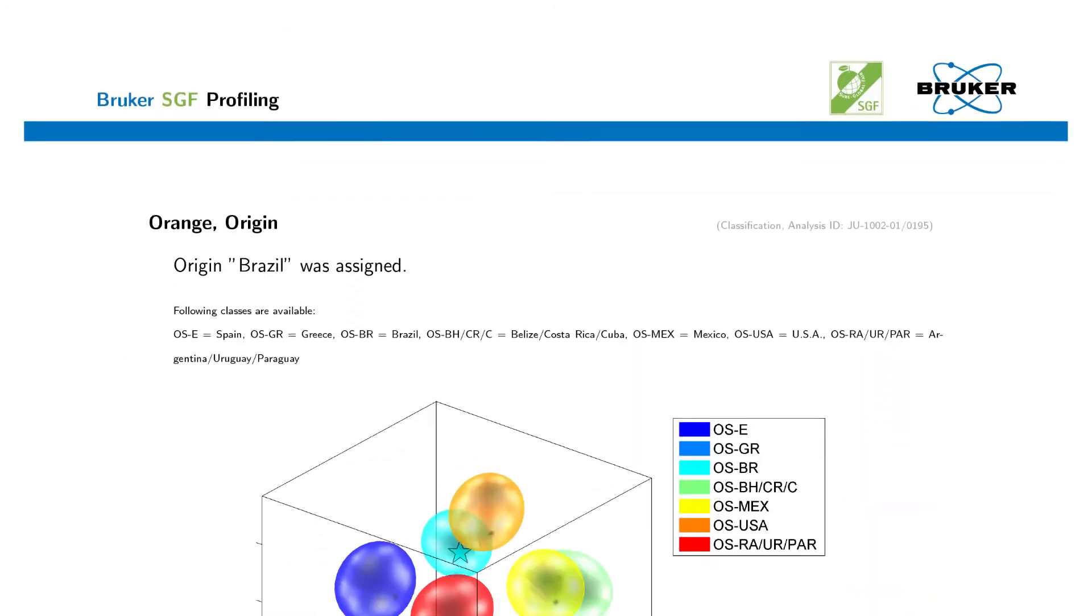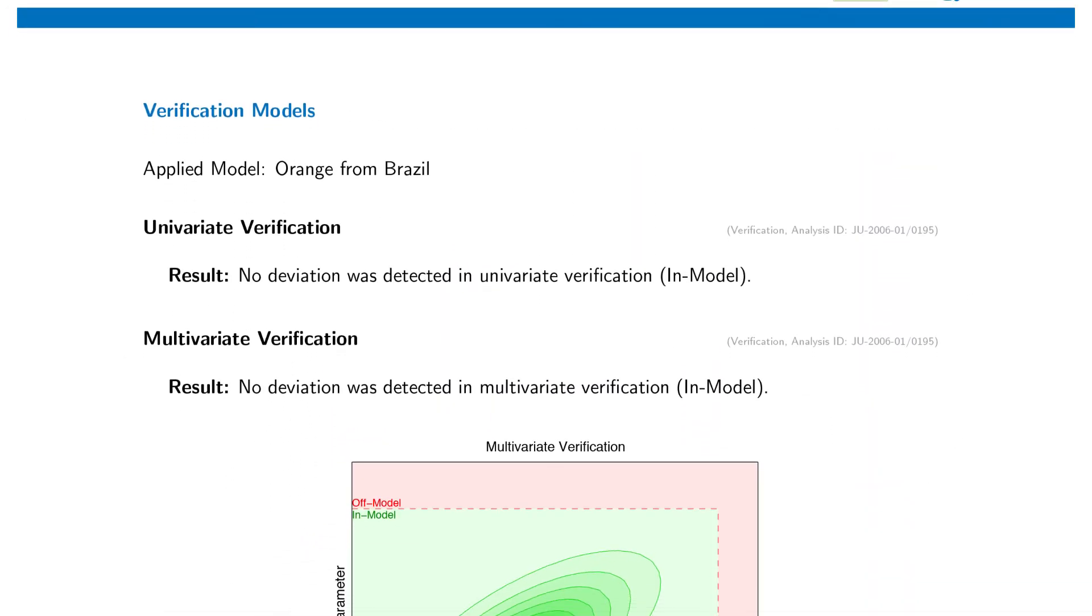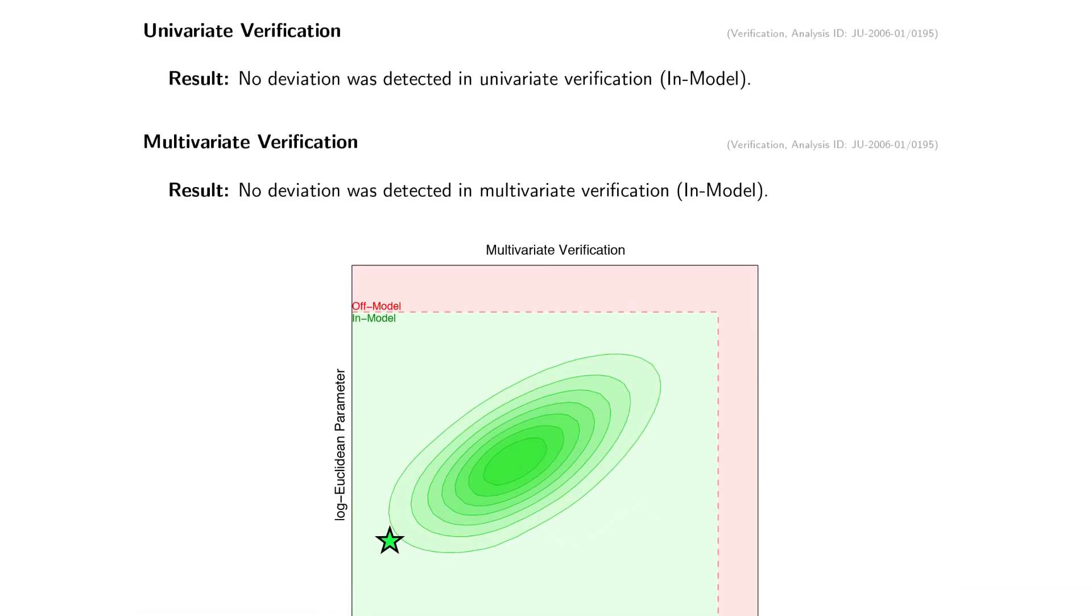Type of juice and geographical origin. The differentiation of direct juice and rediluted concentrate is also part of the automatic report.